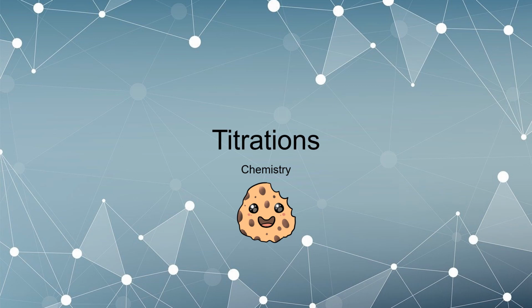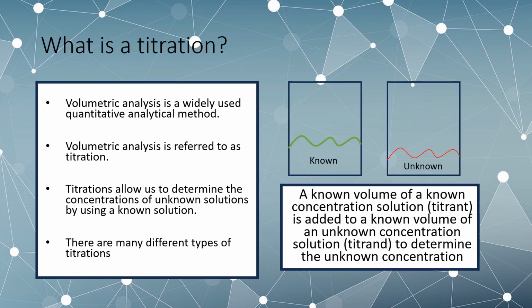Today we're going to be exploring the topic of titrations. So, what is a titration? A titration is just a fancy word for a volumetric analysis. Now that might sound fancy as well, but all it means is an analysis between two solutions, hence volume, remembering we measure solutions in volume.